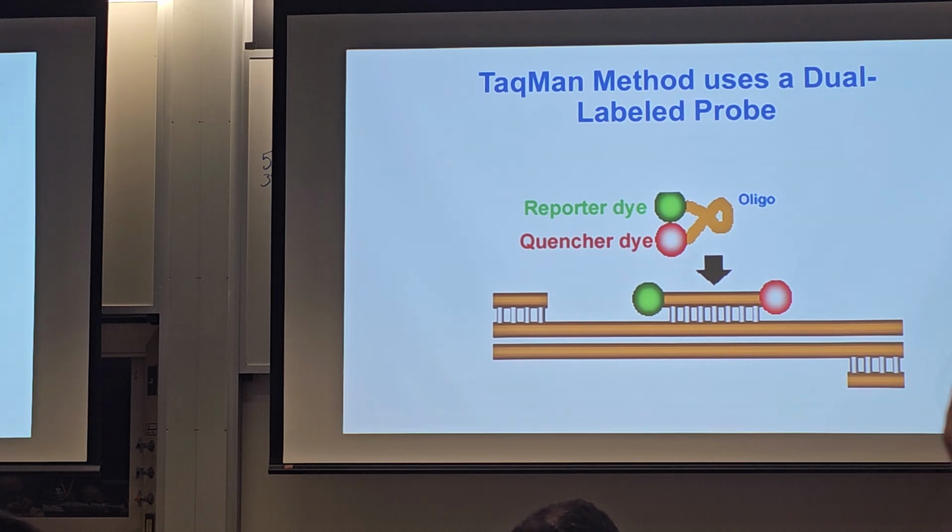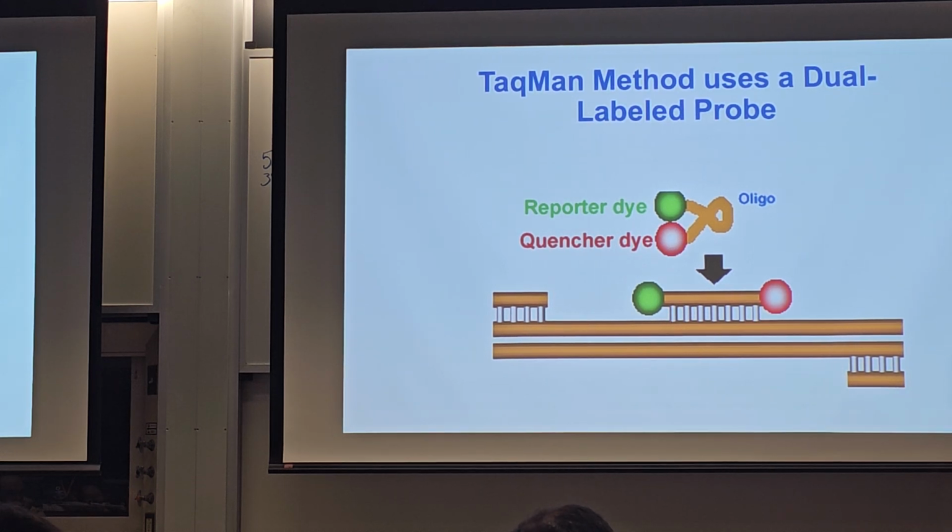And so if you ask people which of these two systems is better, the SYBR system or the TaqMan system, most people will say, well, the TaqMan has this inherent advantage of having this third molecule giving you specificity. But these probes that are designed with the reporter at one end and the quencher here, and now we always use one with a quencher in the middle, these are not cheap. And so this kind of assay is more expensive. So it's got an advantage, it also has the drawback of cost. And so which method you use might depend on your budget.